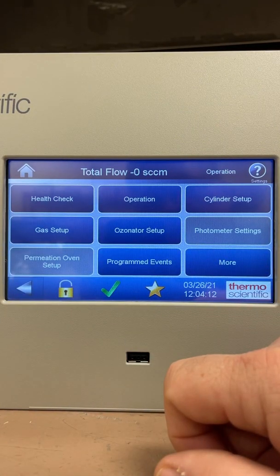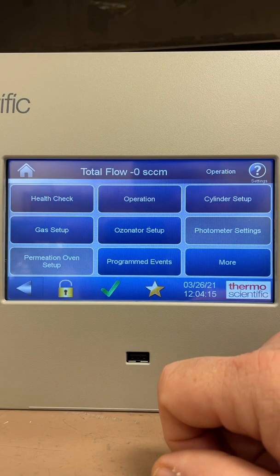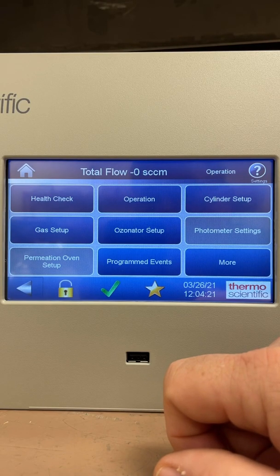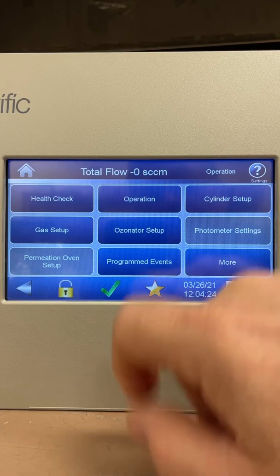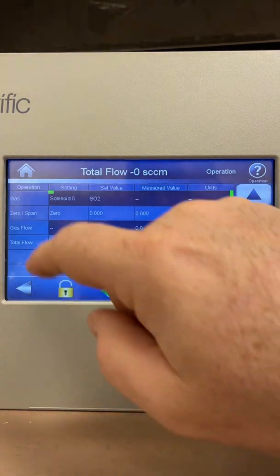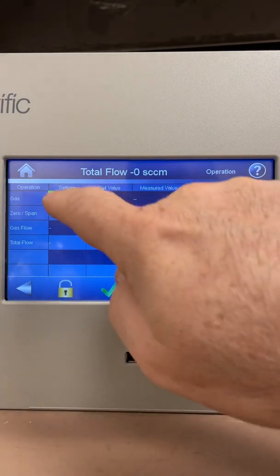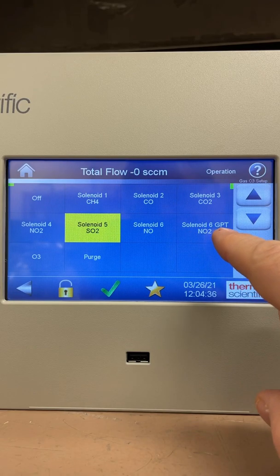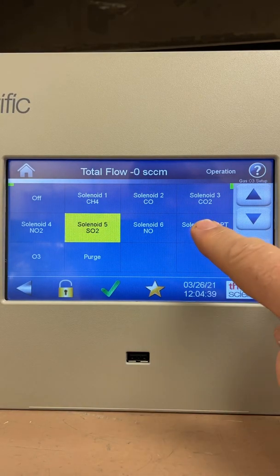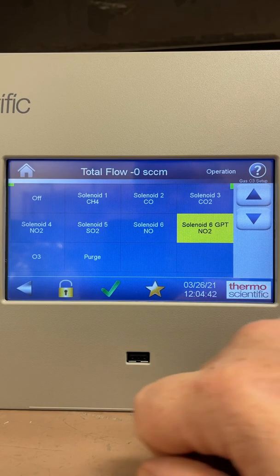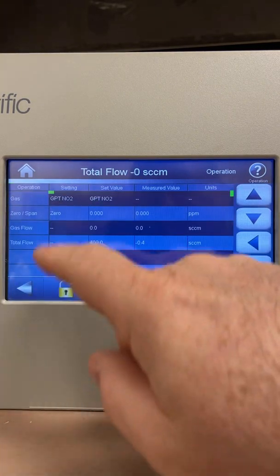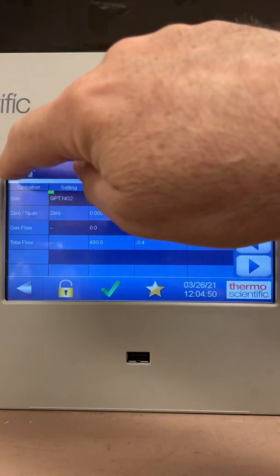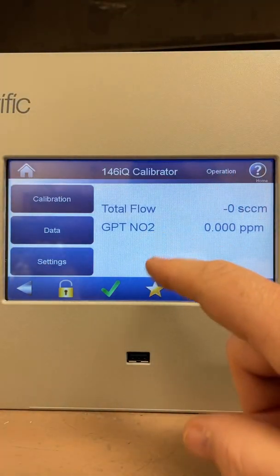That's how simple the cal gas operation is for this multi-gas calibrator. If you want to do a GPT — gas phase titration — on your NOx analyzer NO2 channel, you go into Operation, back to where the solenoids are set. You'll notice it has solenoid 6 and GPT NO2. Select solenoid 6 GPT NO2, go back one screen, and now it's highlighted GPT NO2. It also shows on the main screen that you're set up for GPT NO2.